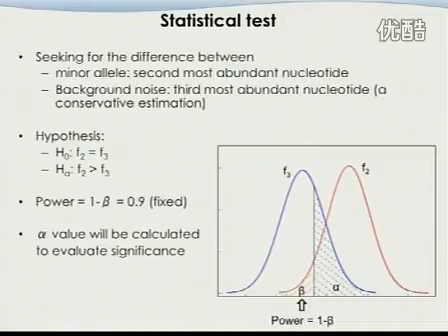If they overlap with each other, I don't have enough confidence to say this is not a sequencing error. But if the depth becomes much higher and the peaks become narrower, their overlap becomes less and less, and the further away they are, the more likely they are minor alleles, not sequencing errors. Does that answer your question?